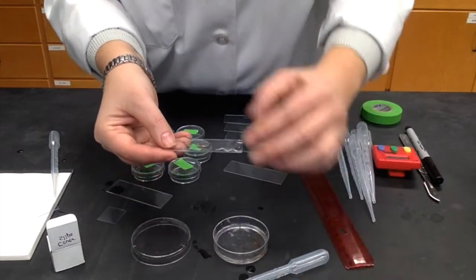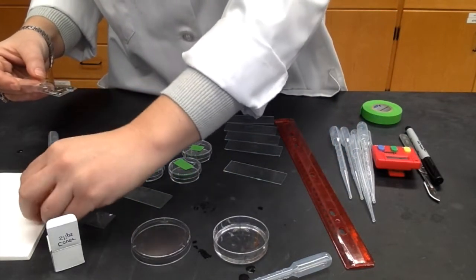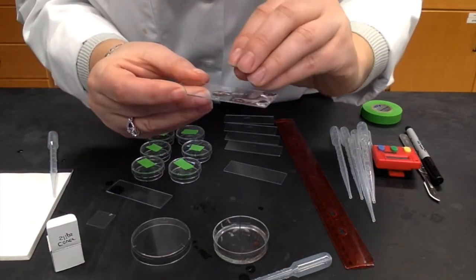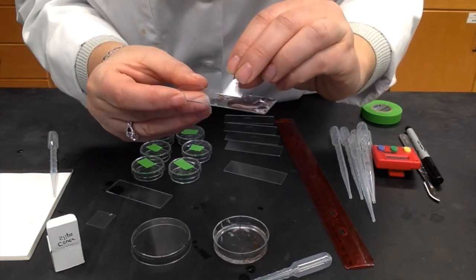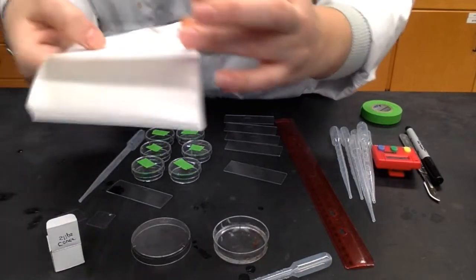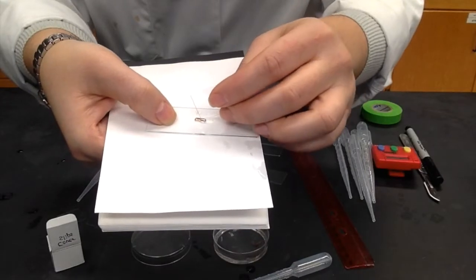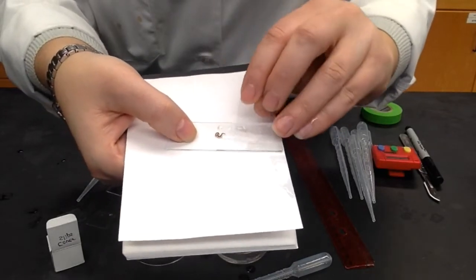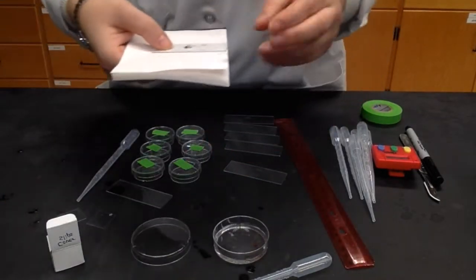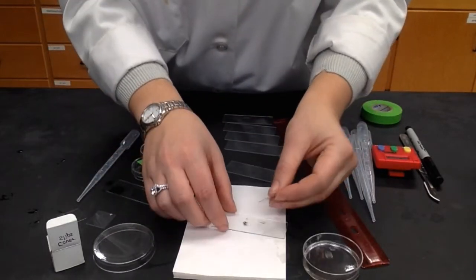Now that you have your worm on your slide, use your cover slip to stretch out your worm. If there's more water on the slide, it means that the worm can move around more. If there's less water, again, it will have less places to move. So here you can see the worm moving in response to the touch of the cover slip. I'll place the cover slip on the table. Place the slide on the table.